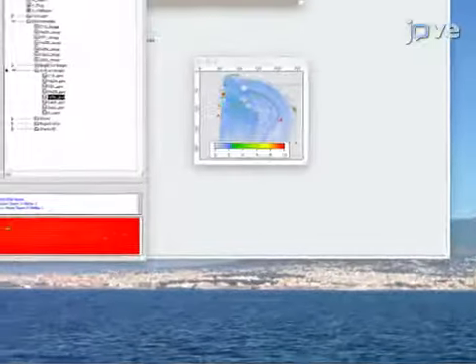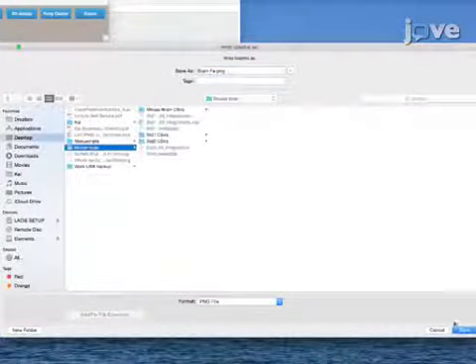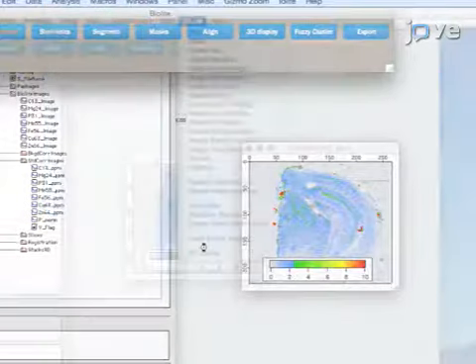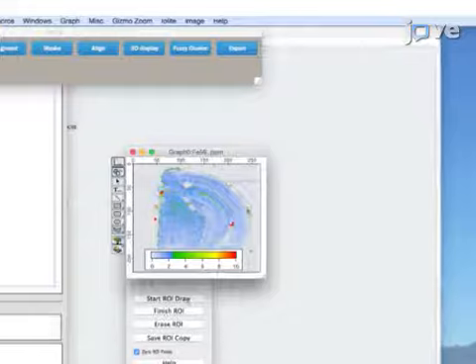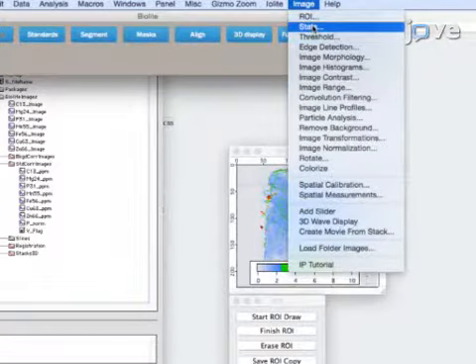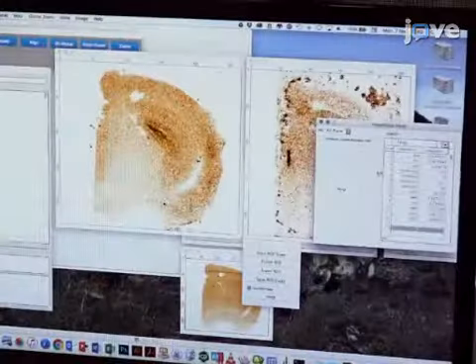Once the image has been colored and annotated, either copy and paste the image into another program or export the image from the image construction software. To activate the ROI tools, select Image Processing from the Analysis packages and choose an image. In the Image tab, click ROI and start ROI Draw. Select the region of interest and then click Finish ROI. In the Image tab, click Stats to obtain the ROI data. Copy and paste the data to a spreadsheet, making sure to save when each ROI is added. Repeat the process as needed.